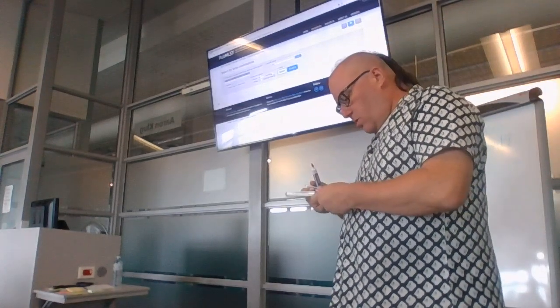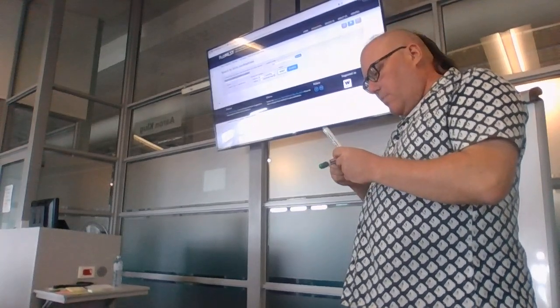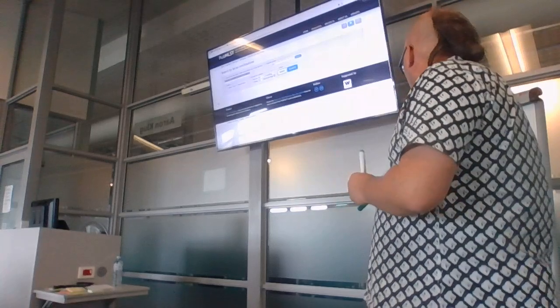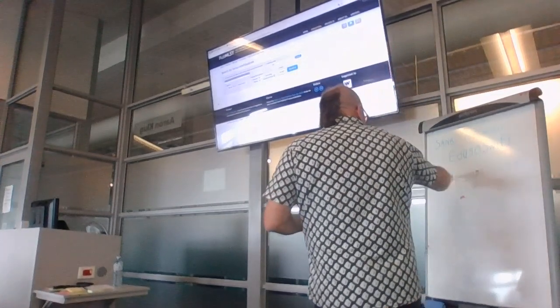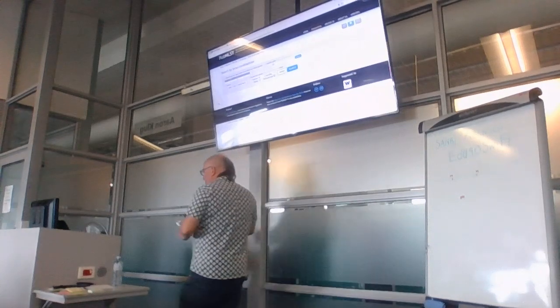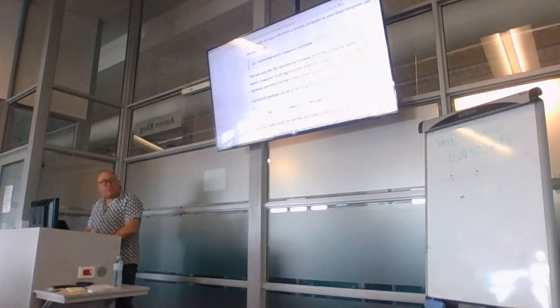And so you can have misassemblies, but the assemblers tend to break up these misassemblies, but the end result is that you can't decide where a read should end up. So instead of getting a single thing back, let me find the diagram that I want to use for this. I wanted to make some slides on this, but then my computer crashed. So yeah.